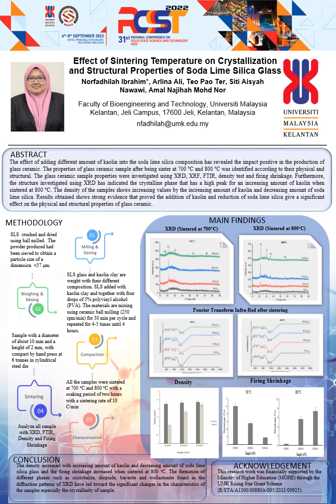And then density and porosity. For density, it increased with increasing kaolin, even for both sintered conditions. However, the sample sintered at 700 has a higher density than at 800.